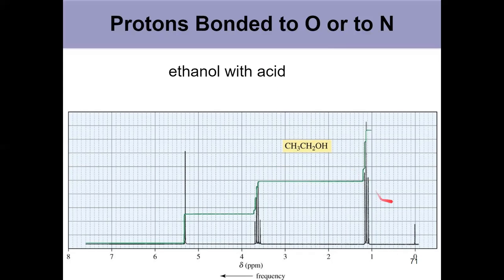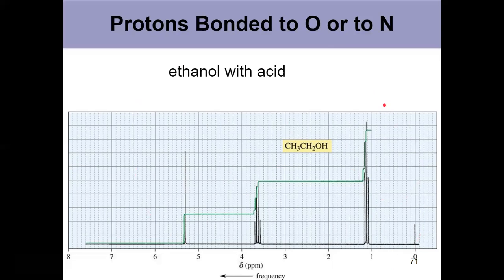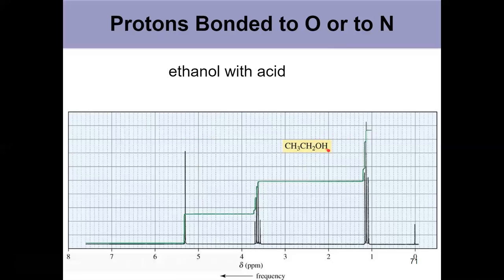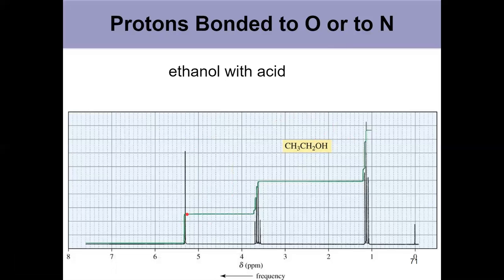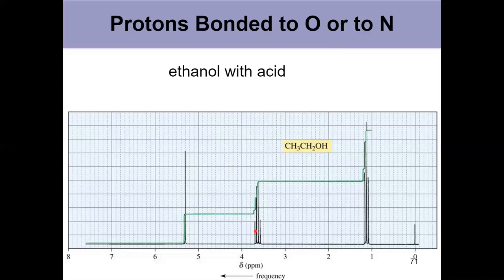This is the proton spectrum for ethanol that we usually see. Okay? And note for the signal for the proton here that's bonded to oxygen, that's this proton right here, that's appearing above 5, the one for this downfield. It's not split. Okay? It's also not splitting the methylene signal over here. Okay? And the reason for that is that it's undergoing proton exchange.